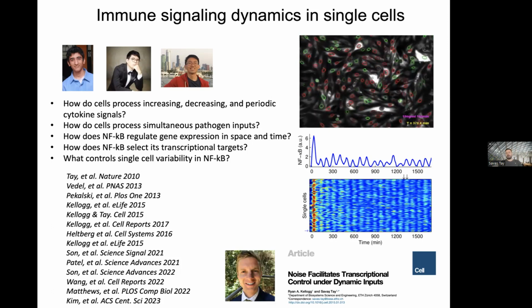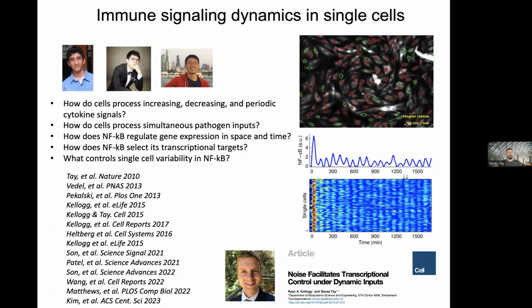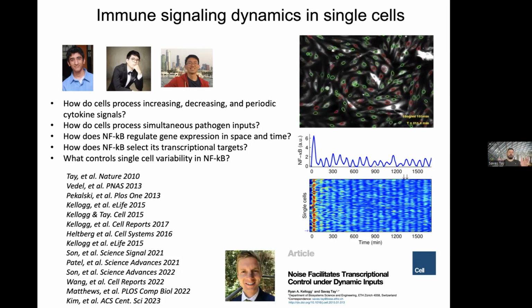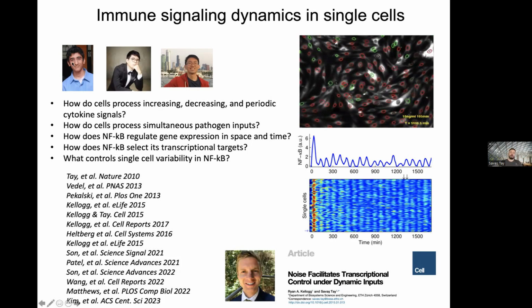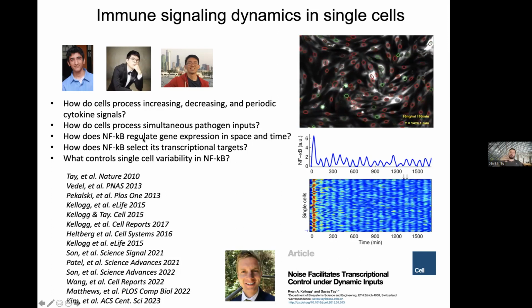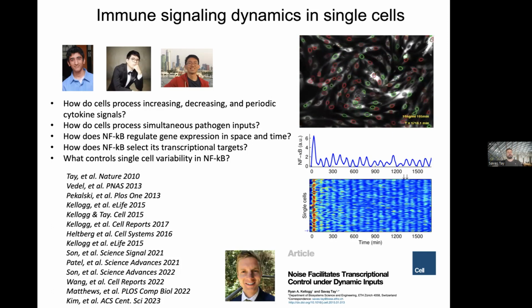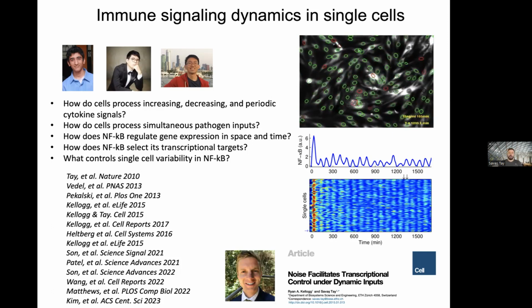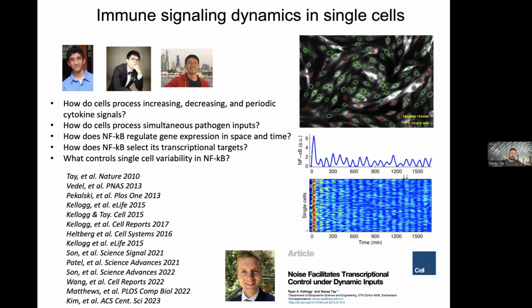These are individual cells expressing fusion proteins that target the NF-kappa B pathway, and we can put these in different culture conditions, stimulate them with different ligands and signaling molecules, basically asking these questions in vitro, study them over time in live cell imaging experiments, and try to make sense of what might be happening, okay? So this has been a very rich topic of research, important both fundamentally as well as for applications.